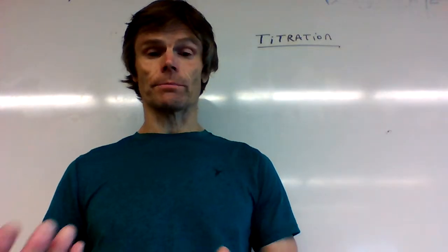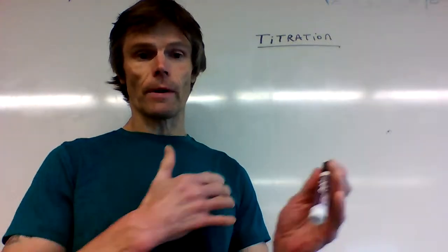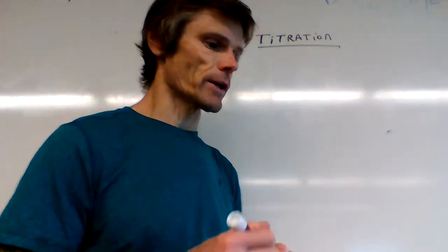Some of you may have done these in maybe a high school lab, but we'll go through this first brief intro, and then we're actually going to do the experiment. So let's begin by discussing what a titration is.